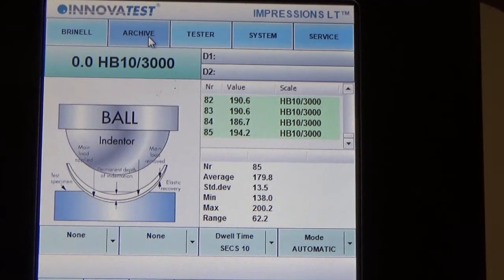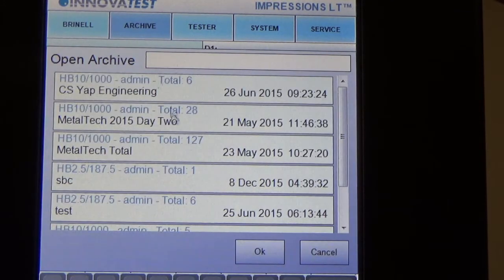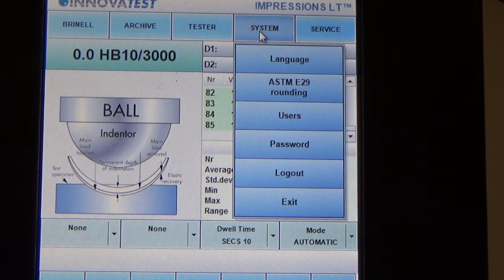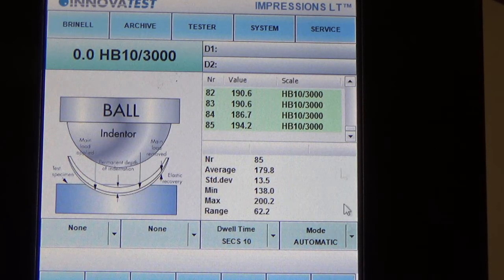Next you will see Archive, where you can save all measurements into different archives and load them back anytime whenever you need. Under the Tester tab you can find information such as serial number and software version. Next is the System tab with settings for language, users, password, logout, and exit. The last tab is Service, which is only used during servicing or calibration by service engineers.